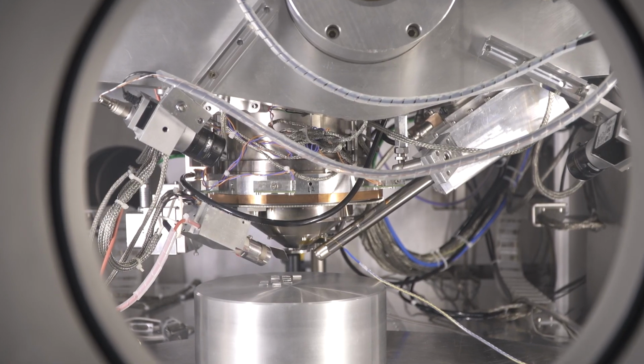We characterize new materials for information technology, for quantum information, for energy materials, batteries, but even down to things like new steels for automobile engineering.